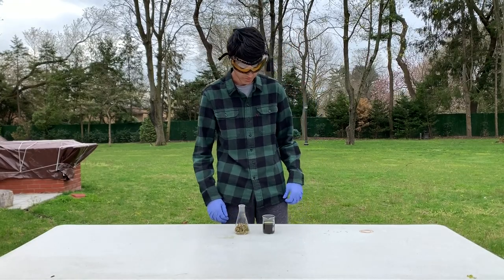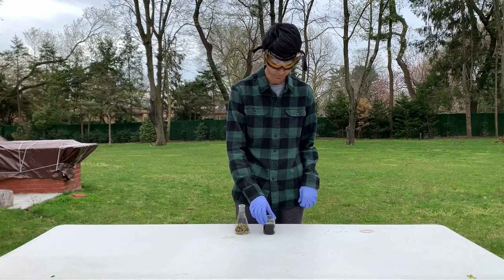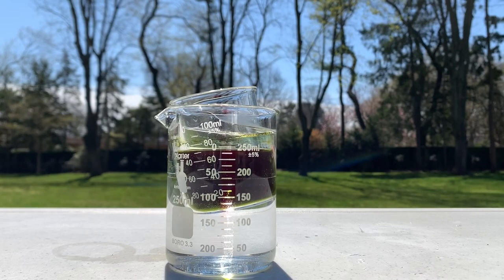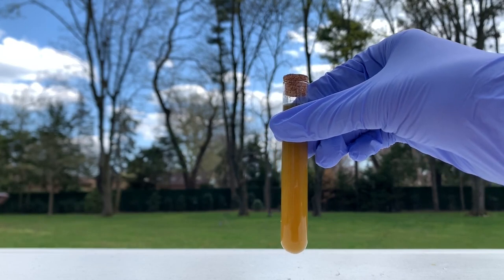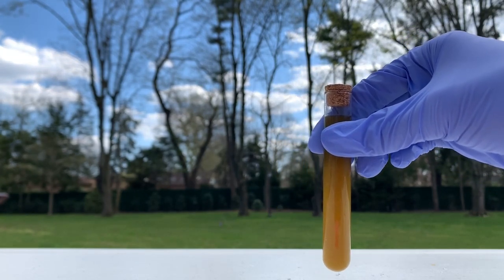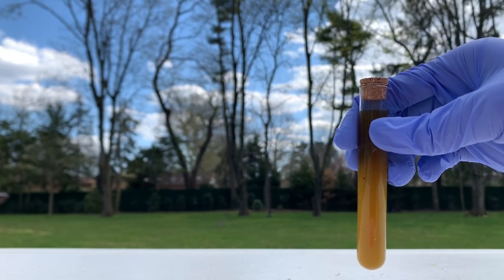Now that it's done filtering, we're going to let all the excess methanol evaporate. To let the methanol evaporate faster, I'm letting it sit in some hot water. Now that all the methanol has evaporated, we have our final product of just a brownish capsaicin.